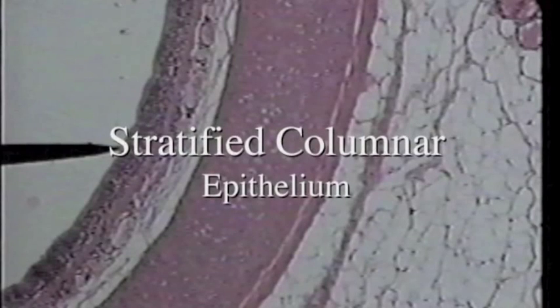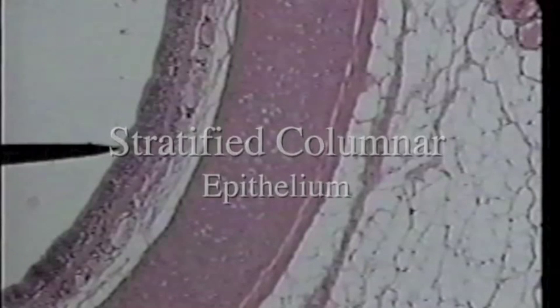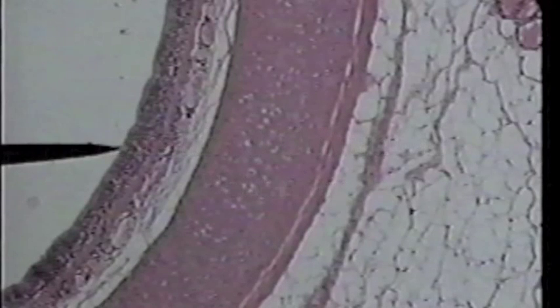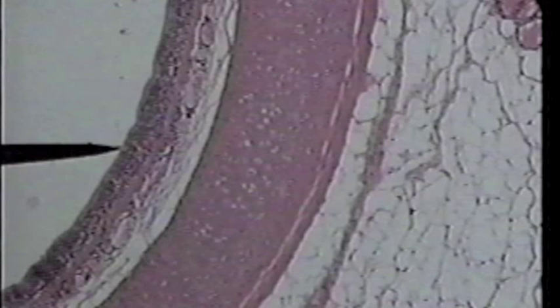This slide is the trachea at low power. The tip of the pointer is on the epithelial layer of the trachea. This is actually a layer of stratified columnar cells, but you can't really tell that this epithelial layer is many layers of columnar cells on low power.